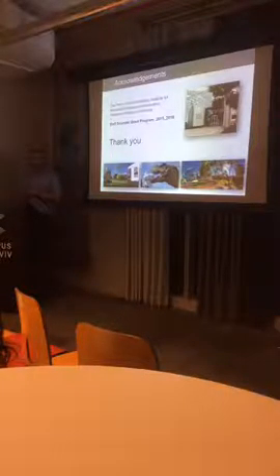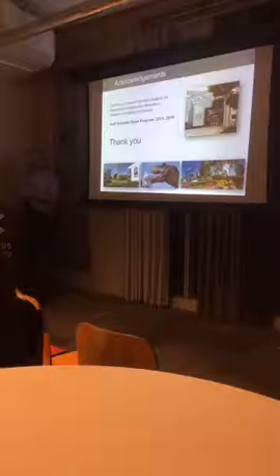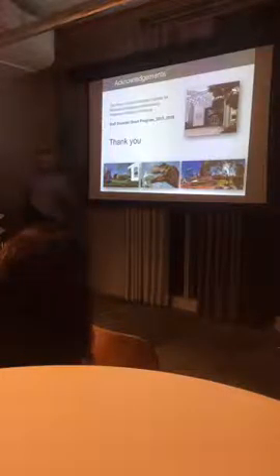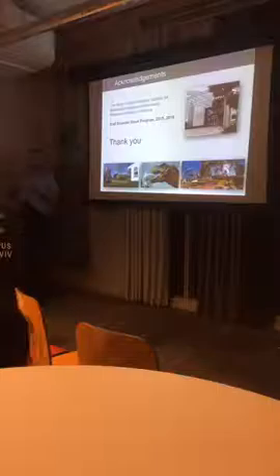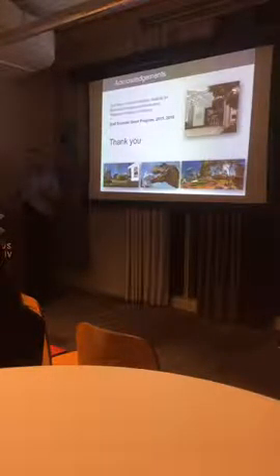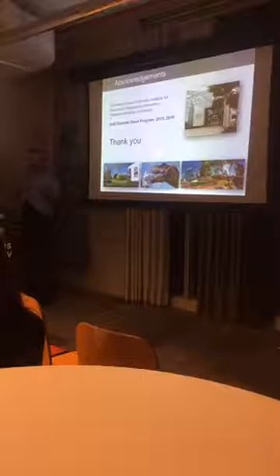So 10 milliseconds per exposure, but at what rate? It would be 50 frames. Okay. If 10 milliseconds, it's 50 frames per second, but usually the camera gives a little bit lower, so we can get 30 frames per second, or 25, it's also good.